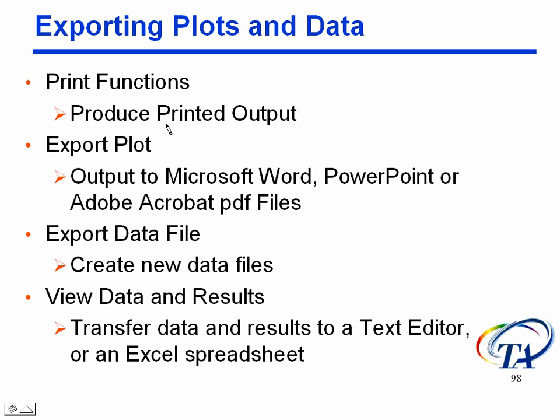Okay, you can also view data and results. Okay, you can view the raw data. You can view the numbers that you get as a result of an analysis. Okay, and you can do that readily using either a text editor or an Excel spreadsheet. Okay, the text editor is built into the program. In order to use Excel, you need to have Excel installed on your system.